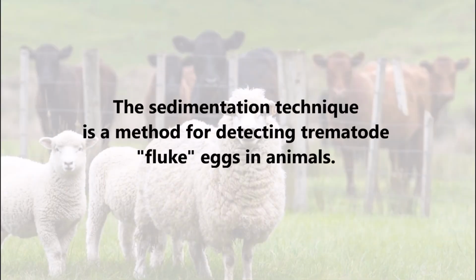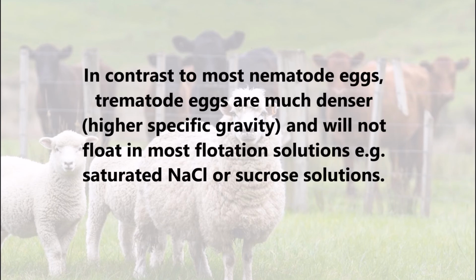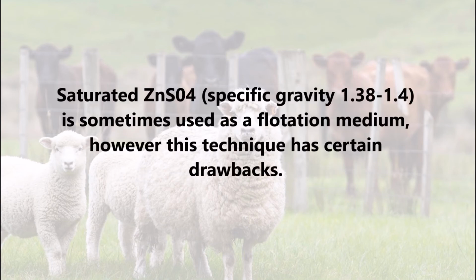The sedimentation technique is a method for detecting trematode or fluke eggs in animals. In contrast to most nematode eggs, trematode eggs are much denser, have a higher specific gravity, and will not float in most flotation solutions. Saturated zinc sulphate, with a specific gravity of 1.38 to 1.4, is sometimes used as a flotation medium. However, this technique has certain drawbacks.